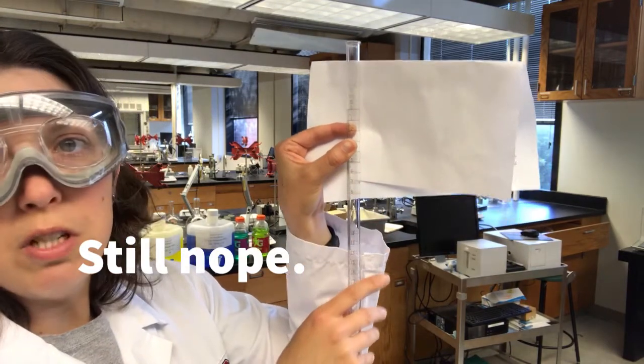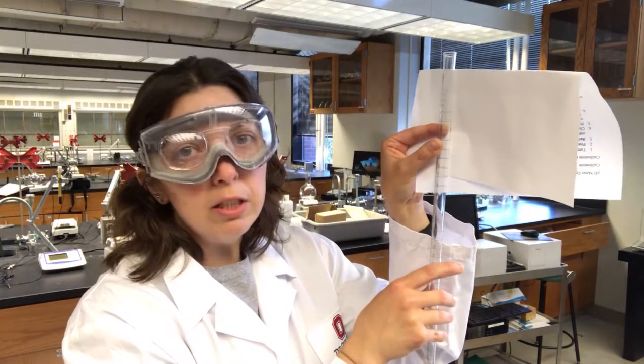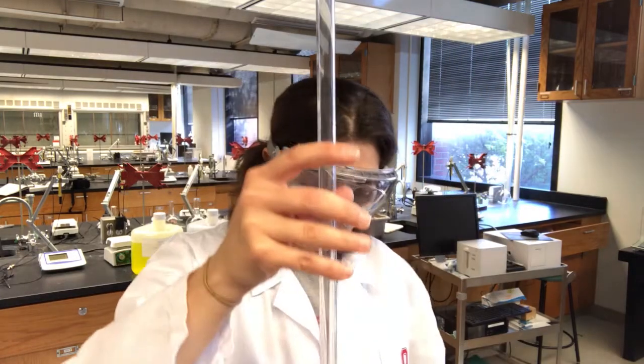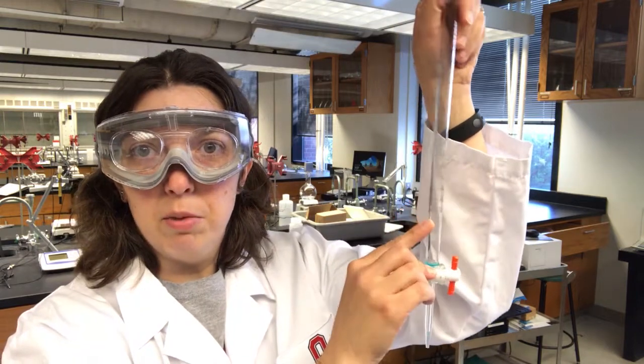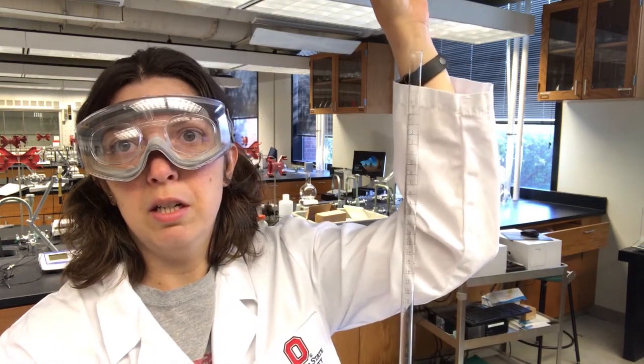That says that if you're using this Buret properly, you're going to be able to deliver 50 milliliters of solution if you're at 20 degrees Celsius. And then at the bottom, of course, is the 50 milliliter mark there, and the top is the 0 milliliter mark. All right, so numbers go increasing as you go down the Buret.